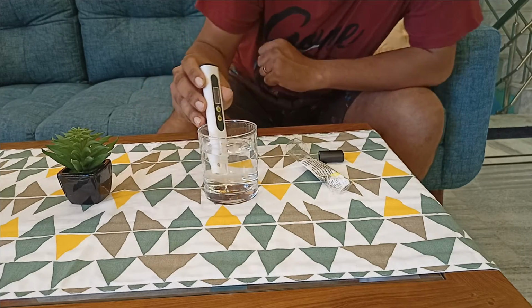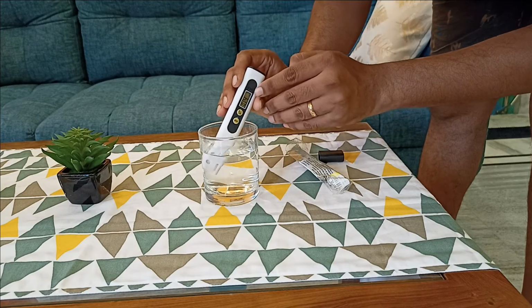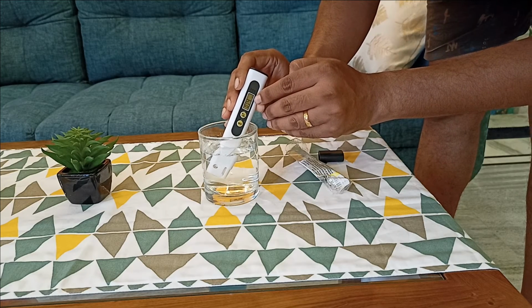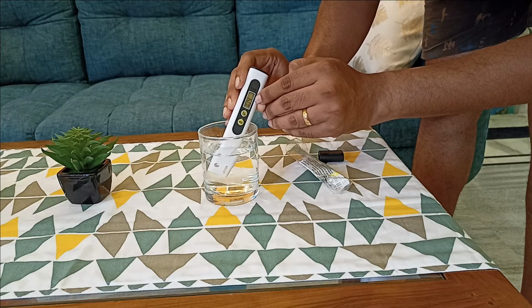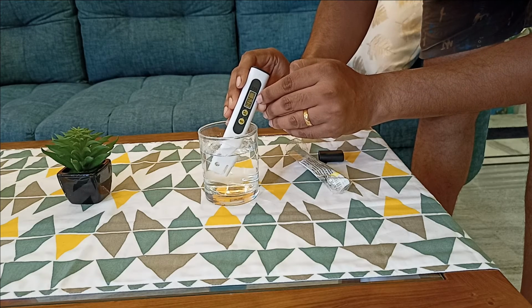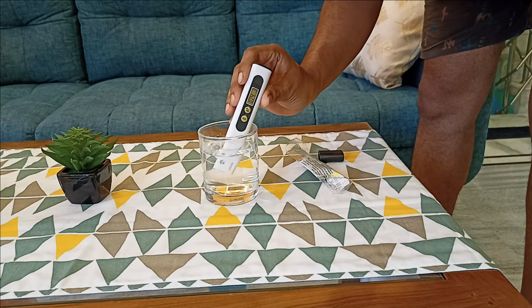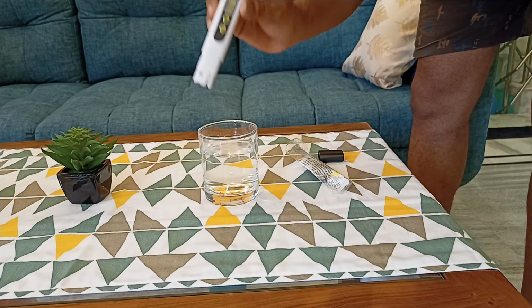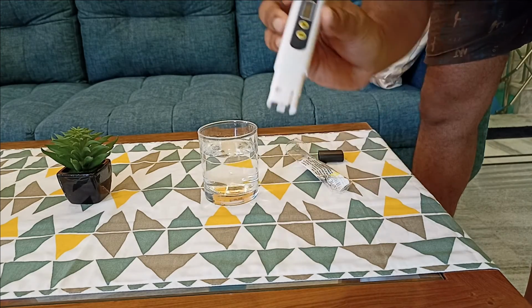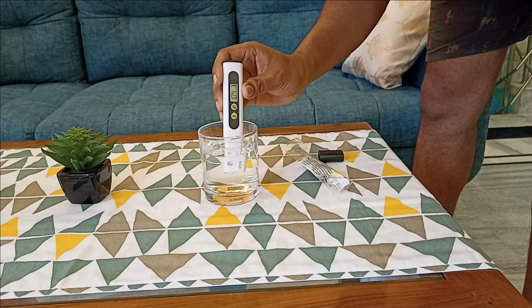Now see, it is showing 104, which means the TDS quality of my RO is within the specifications and it is good. So this is the end result. We need to verify this every day, because it is our health concern.